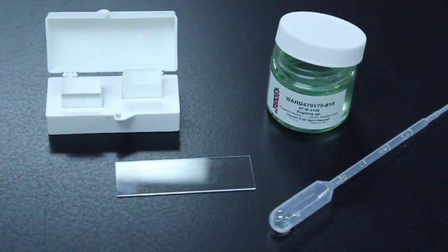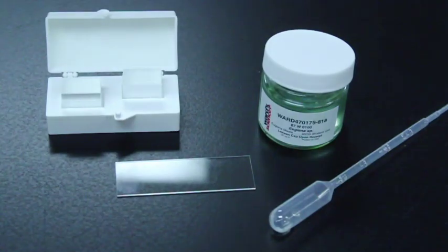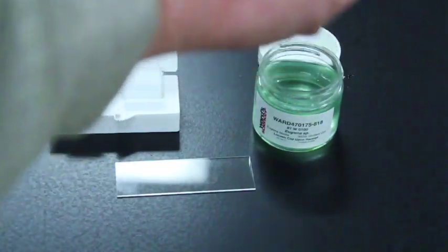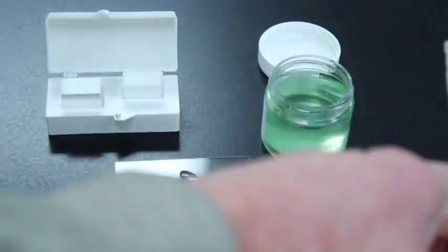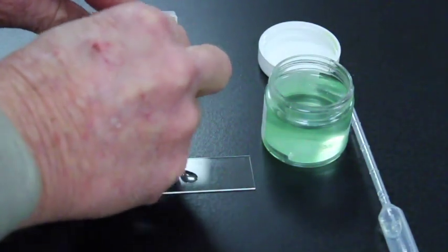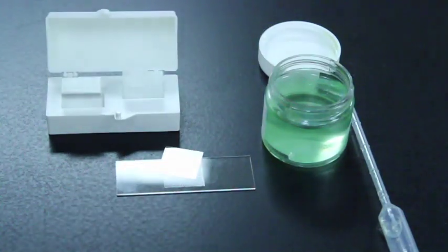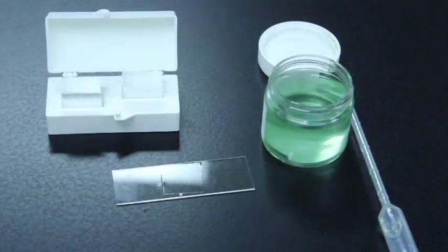Now we're going to look at the euglenozoans. Here is our culture of euglenozoans, or euglena, and I'm going to quickly make a wet mount. The euglena are easy because everything is green, so every single drop has some euglena. I can easily take a drop, grab a coverslip, apply it to the top, and I'm all set and ready to go.